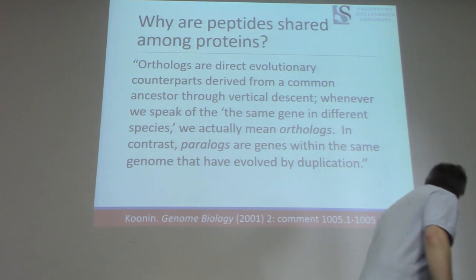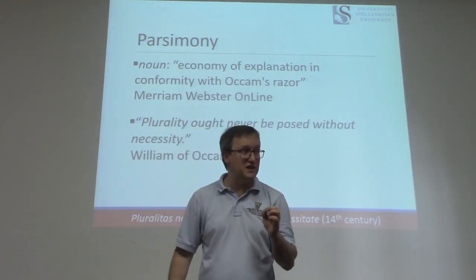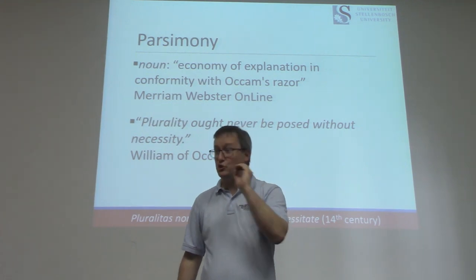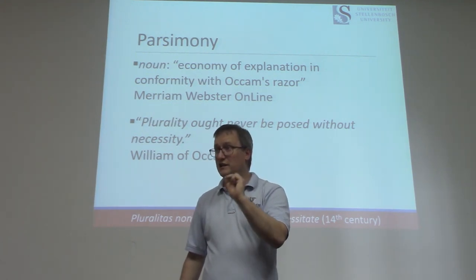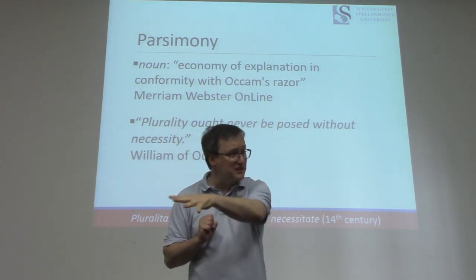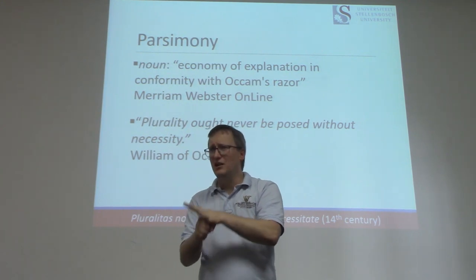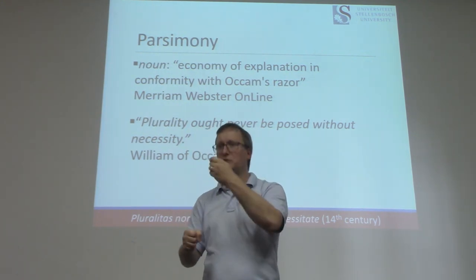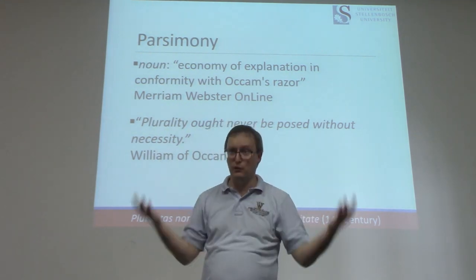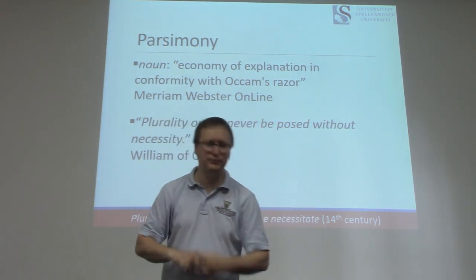Now, did I include a slide about the other problem? Oh, I didn't. I would just point out that in many protein databases, different transcripts are translated and listed separately in the database. So if you have multiple transcripts from one gene, even if there's no gene duplicate, you can still have that peptide appearing in multiple protein entries. So isoform differences or transcript differences can also lead to this multiple listing.